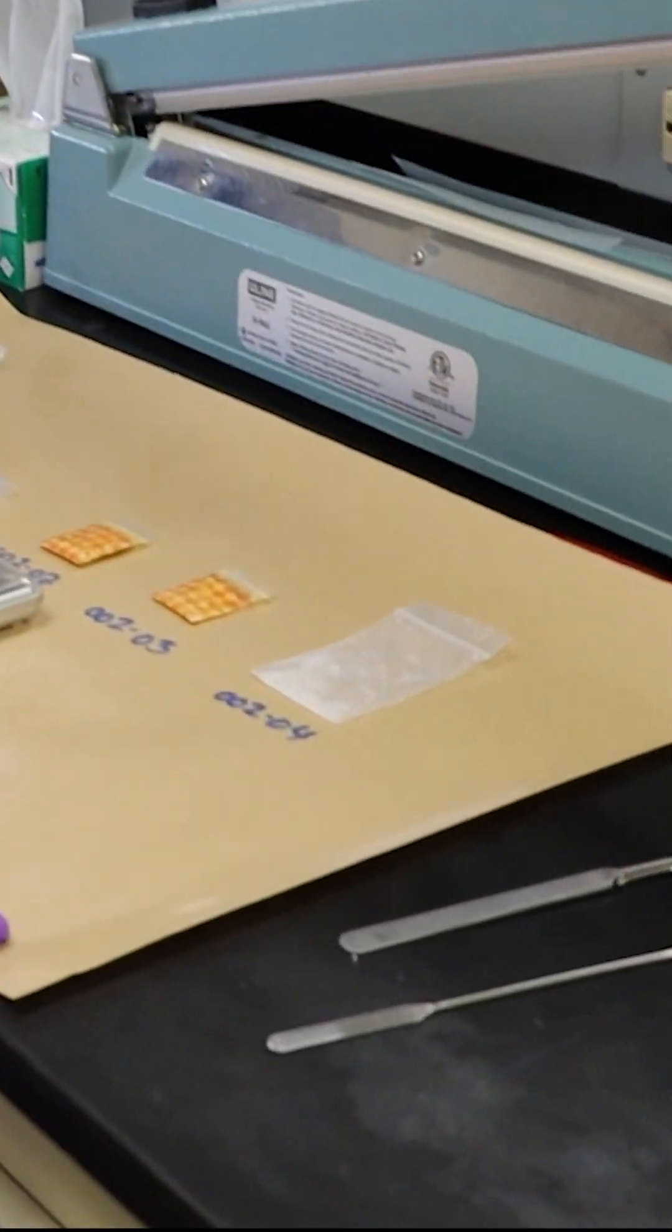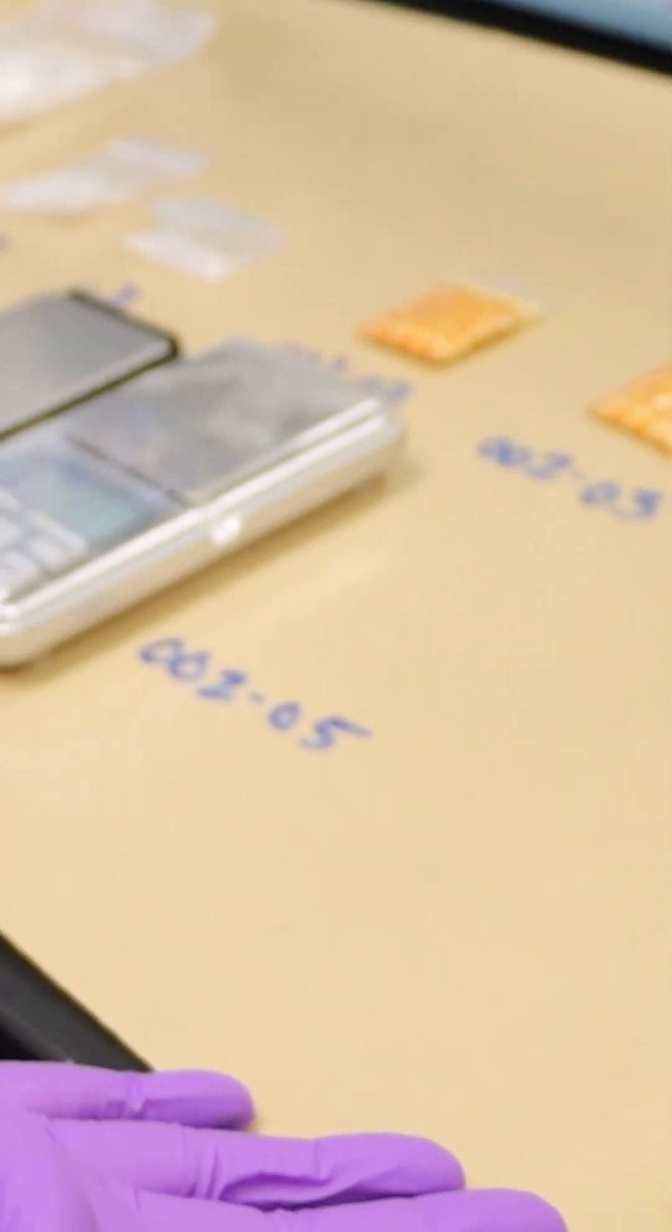This is an example of the evidence that we would have. I've numbered the evidence. I'm going to take a weigh boat and zero it out.